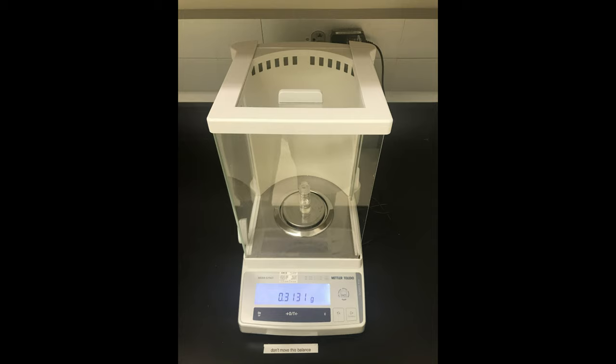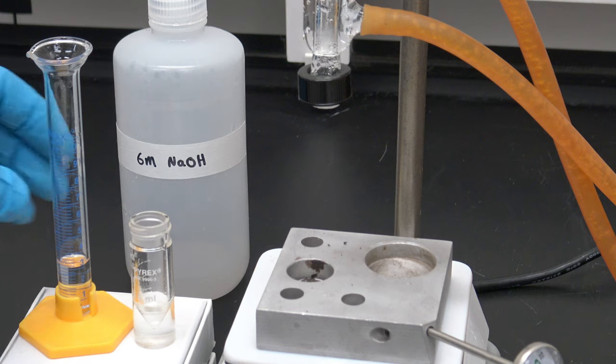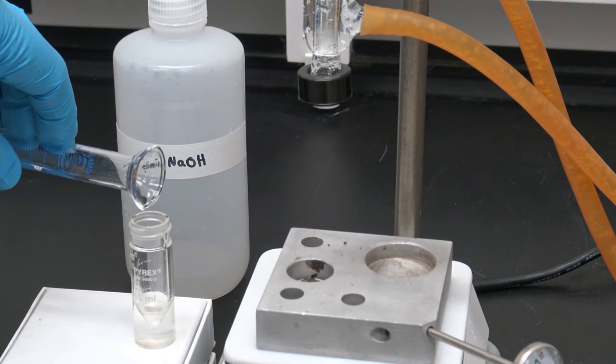So first I tared my reaction vessel, and then I added methyl salicylate. I added 0.3131 grams. After adding my boiling chip and my methyl salicylate, I'm now going to add 2.5 milliliters of 6 molar sodium hydroxide to my reaction vessel.